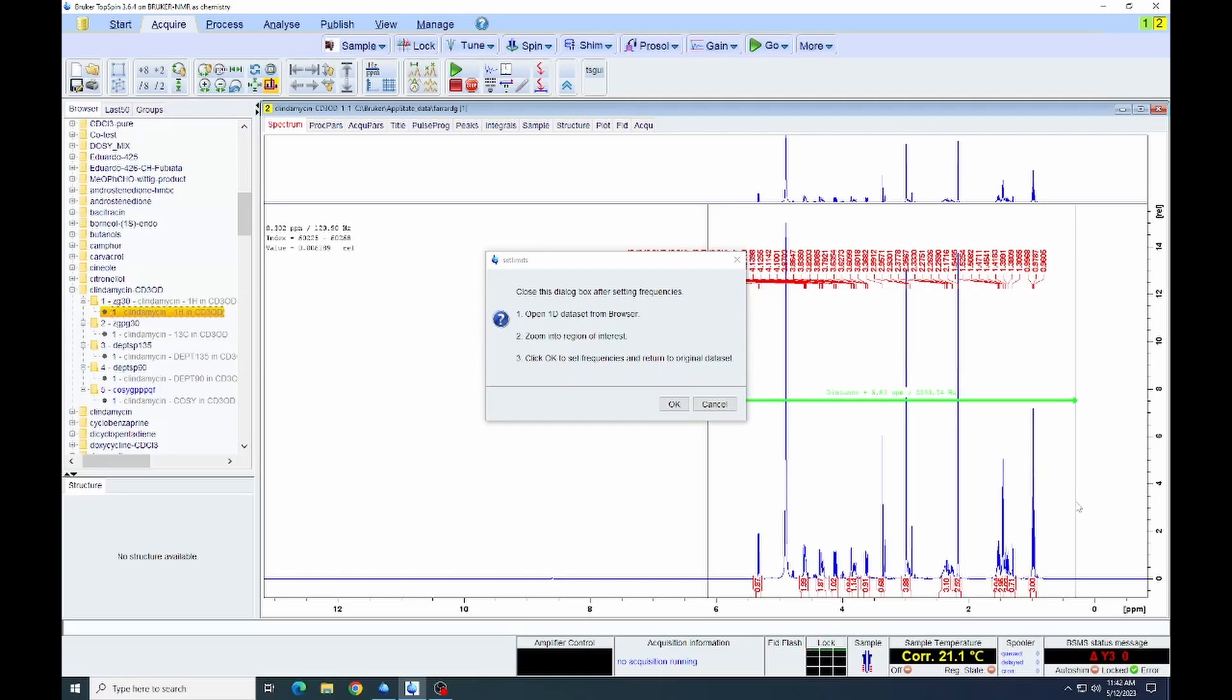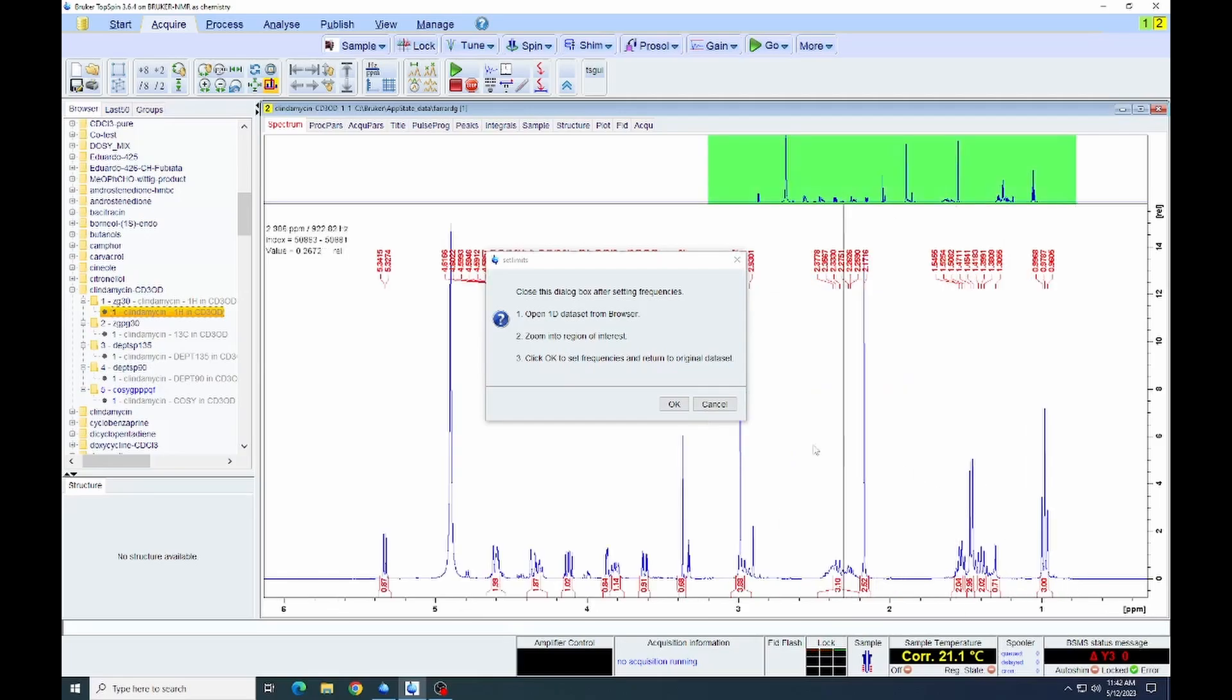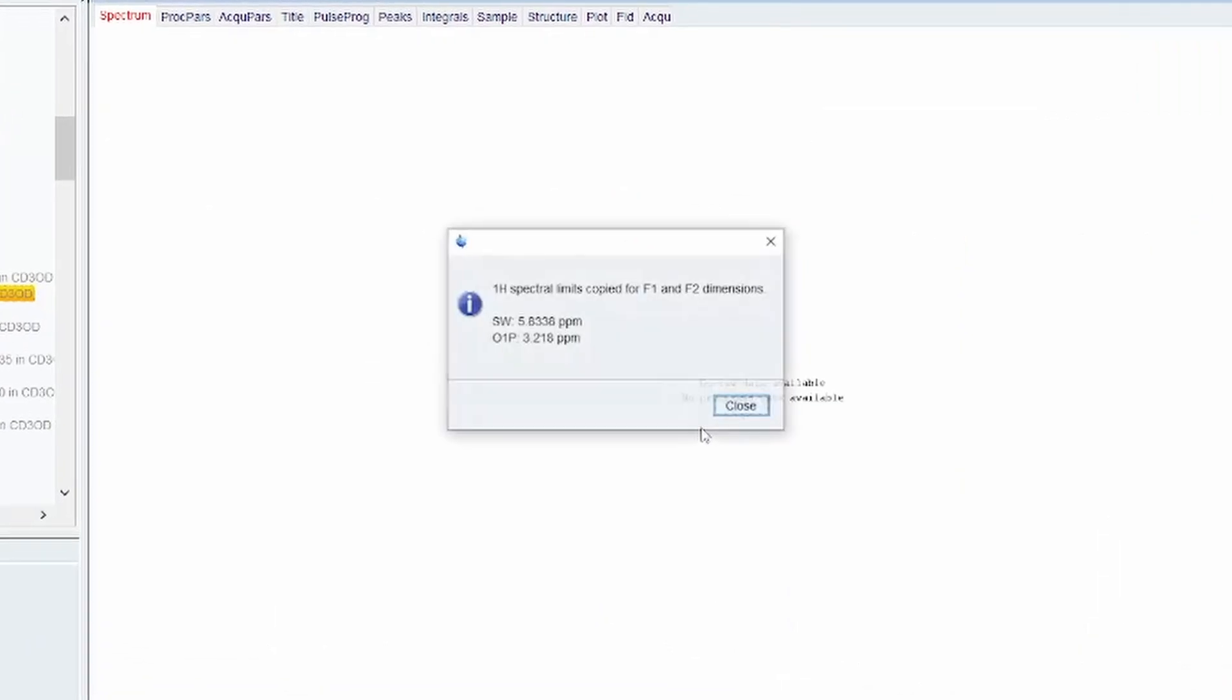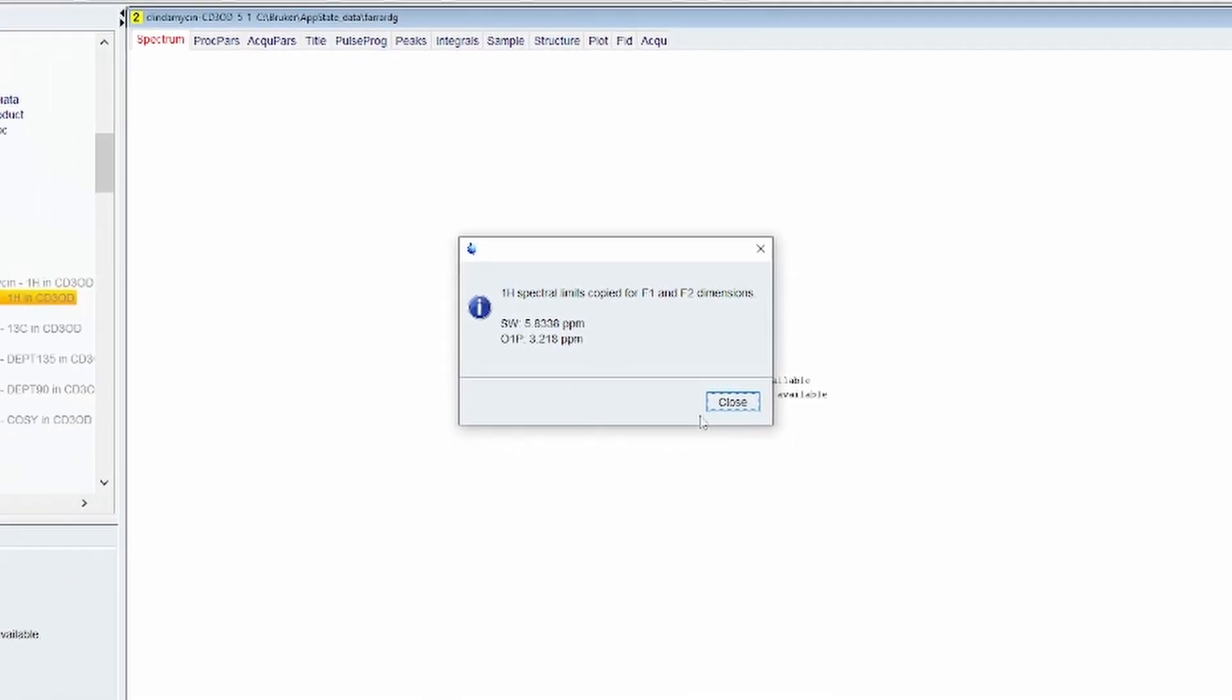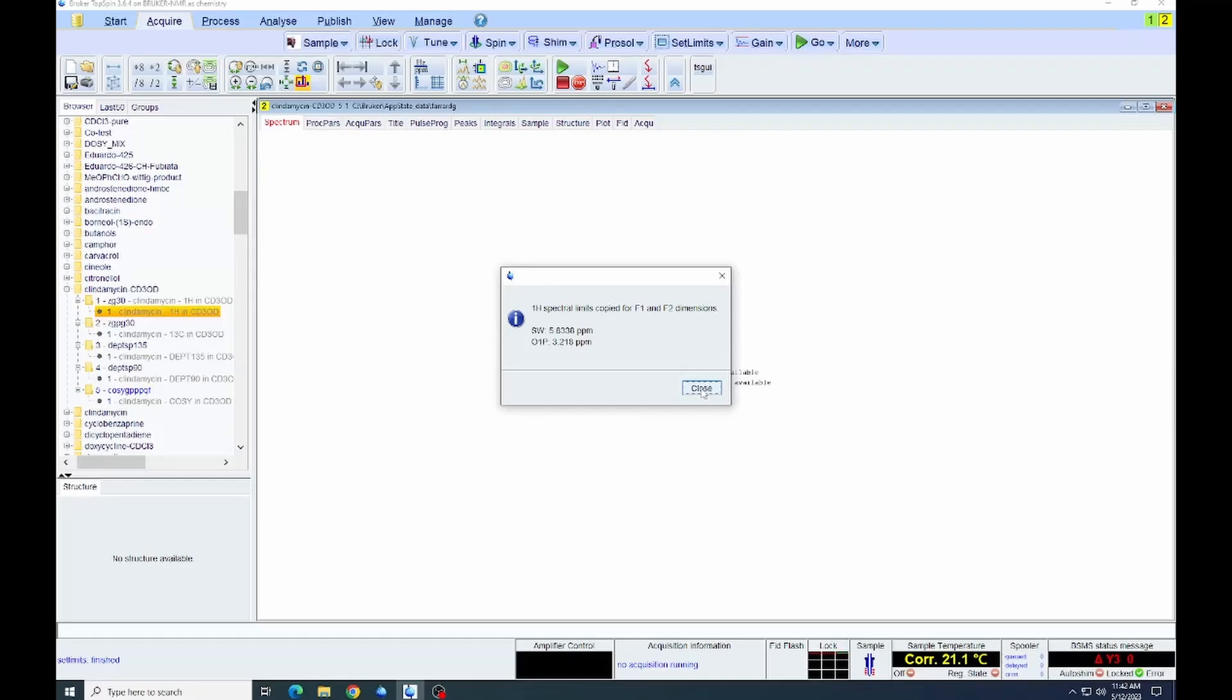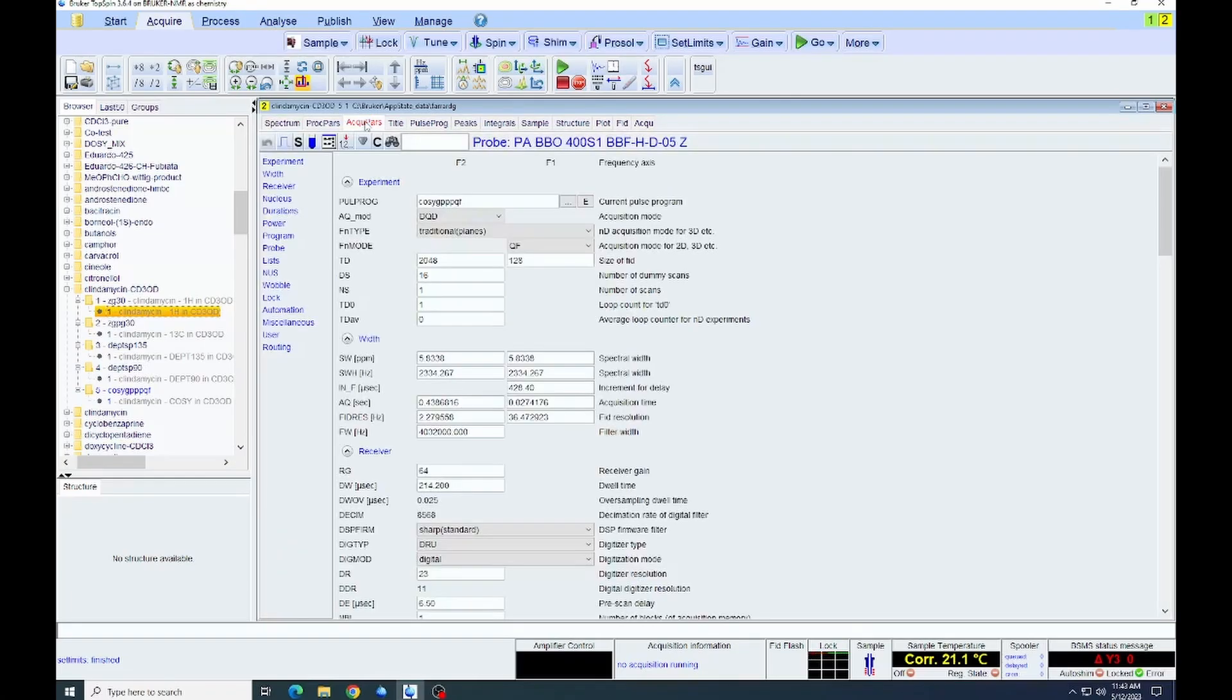And once it's zoomed in, at that point, we will click OK. And that will automatically set the window. It will set the offset as well as the spectral range that we will be acquiring. And it shows this in the window. We can click close. And if we go to the parameter set, we'll be able to see that it has set those particular parameters in that.